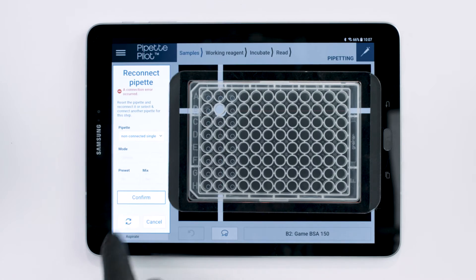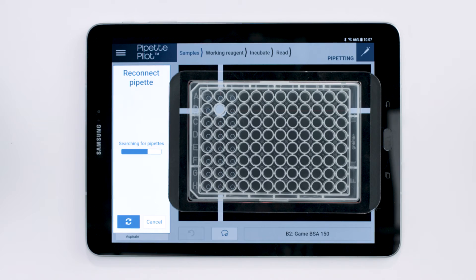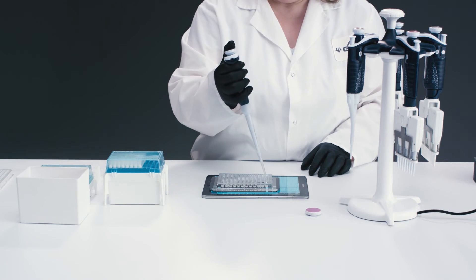Then click the Refresh button at the bottom of the Reconnect Pipette notification box. After refreshing, select Liquid Handling Preferences like Pipetting Mode, Pre-Wet, and Mix. Click Confirm and continue your run.